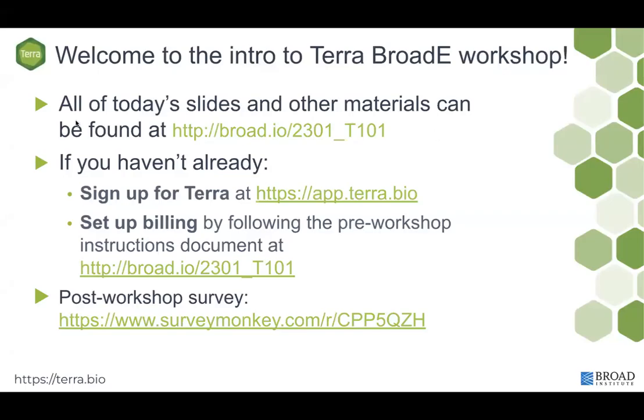Sorry, I just have one question. When we are looking for this billing project, would it be, on the console where there's an option, a drop-down menu for billing projects? Should this T101 be coming up there?